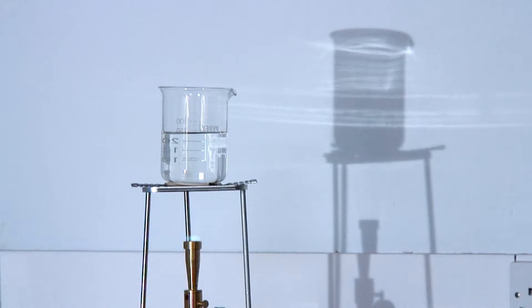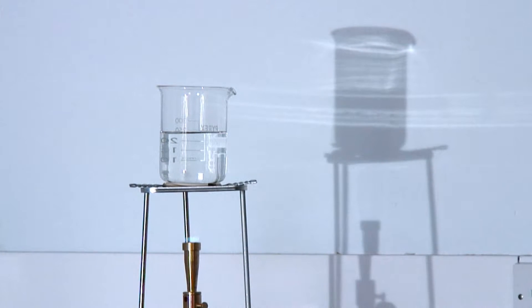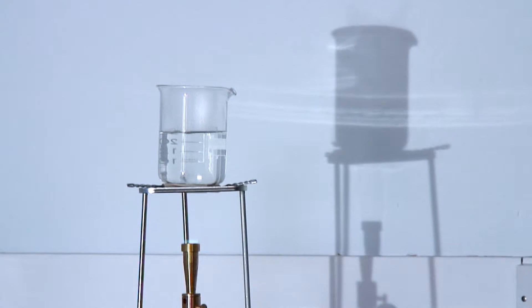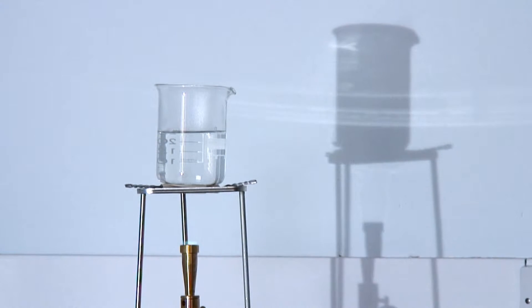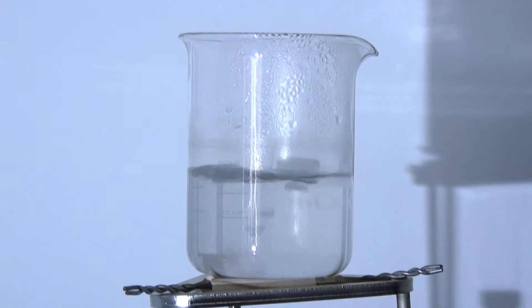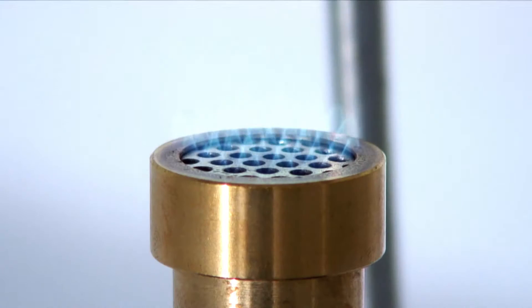To concentrate or evaporate a sample to dryness, the traditional method has been to boil the sample. Boiling uses heat energy to convert liquid to vapour, which appears as bubbles. The problem with regular boiling is that it may damage the sample.